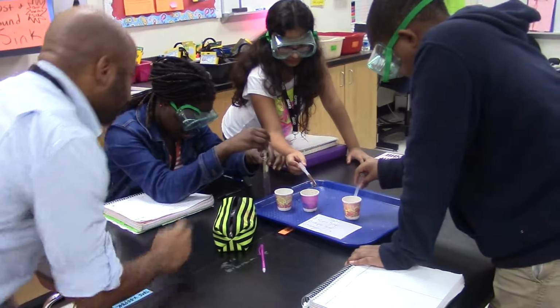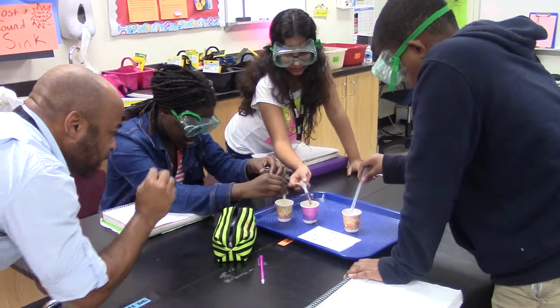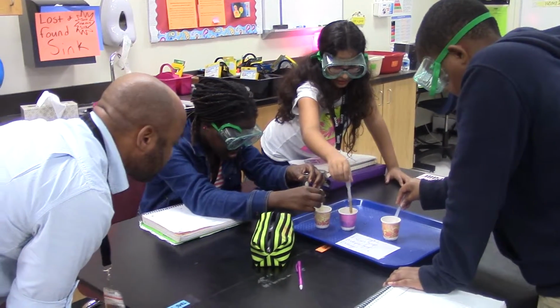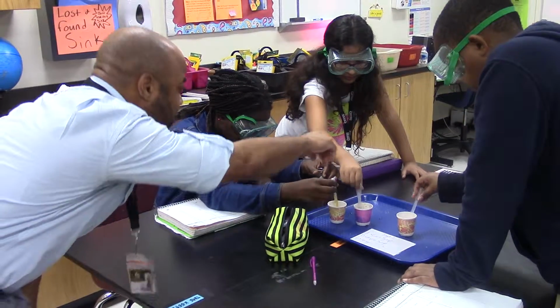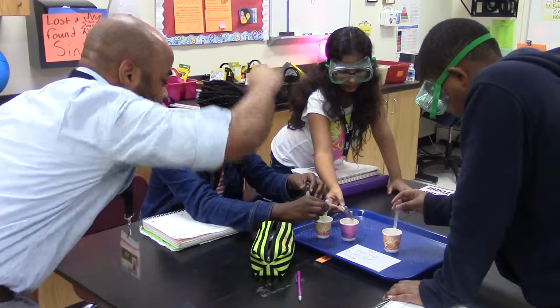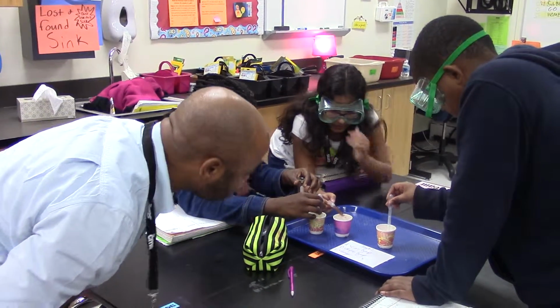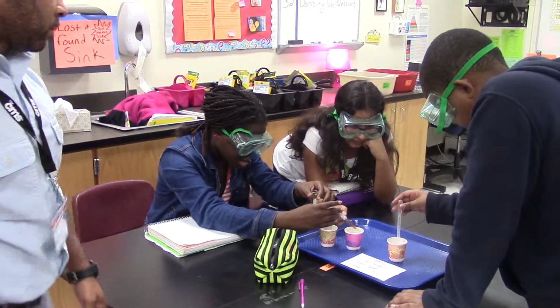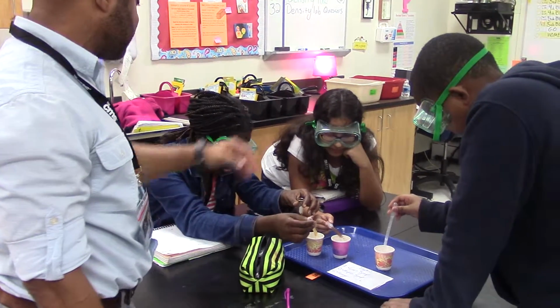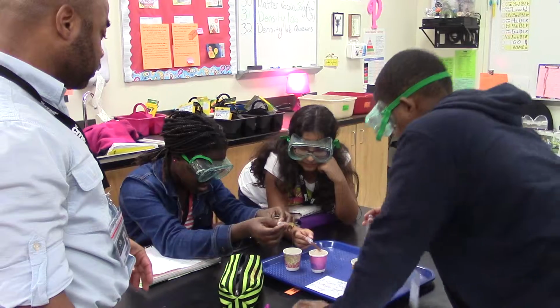You can tell. Put a little bit more in there, just so you can make a good distinction. So that's your honey. So that's what you said was the most dense. Yeah, just squeeze it. Squeeze it and then let go, and then it'll suck it right up. So just put a little bit more honey in it, and then Javella, you'll put the maple syrup in.